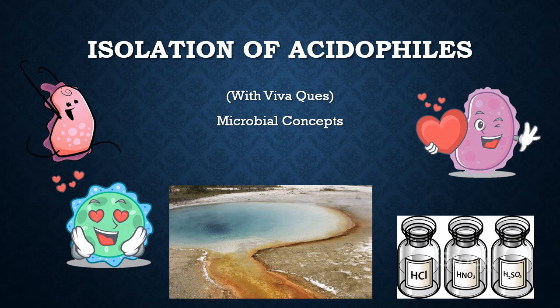So in this video we are going to discuss isolation of acidophiles. Okay, another example of extremophiles, and you have this in your masters practical. So in this video we will be discussing acidophiles, the sampling environments, how to do sampling, the protocol, the Viva questions, etc. So do watch this video till the end.